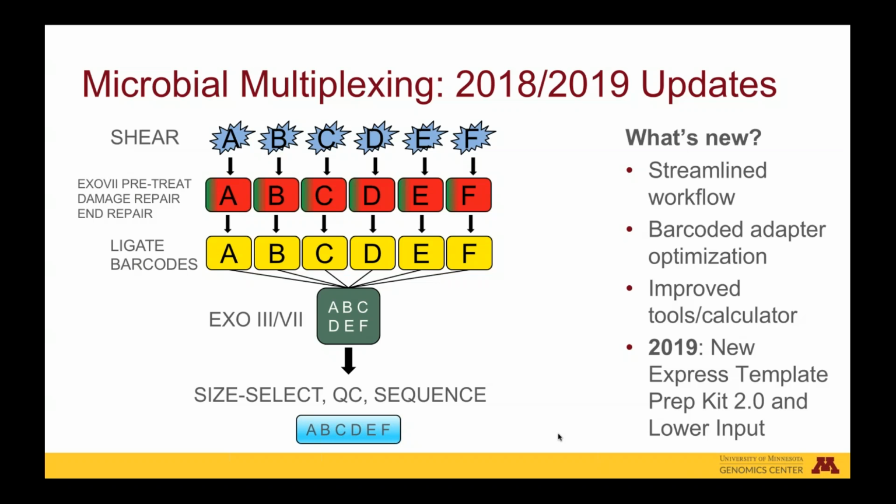Genomic DNA requirements are around a microgram for each microbe, and although I'd recommend starting with a bit more to account for sample loss that's possible, samples are first sheared to a consistent size of around 10 kb using Covaris g-TUBEs, and then they're cleaned up and thoroughly QC'd based on size and concentration.